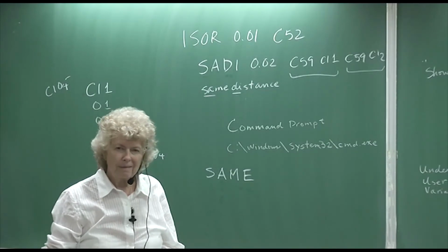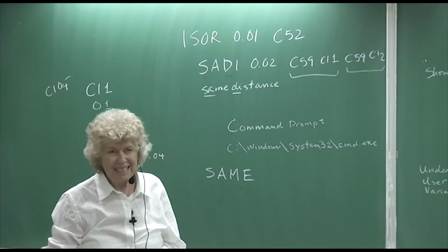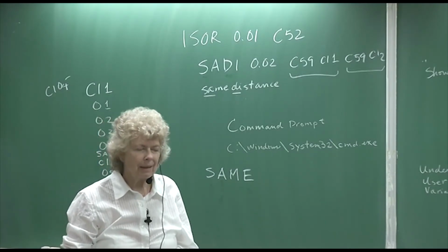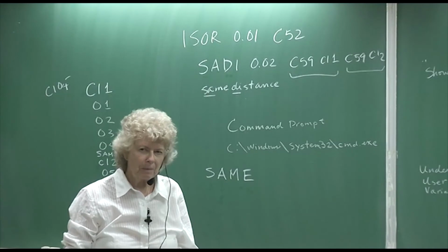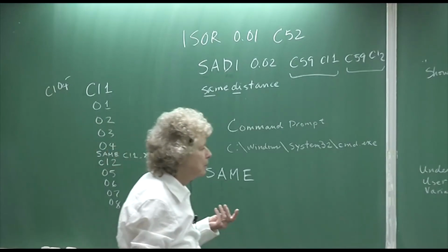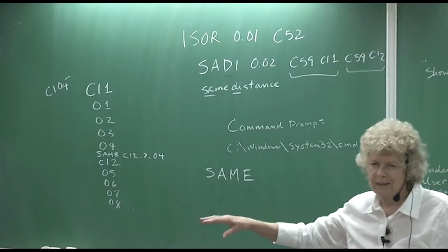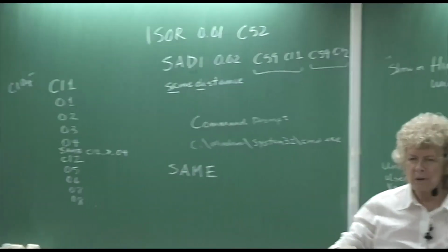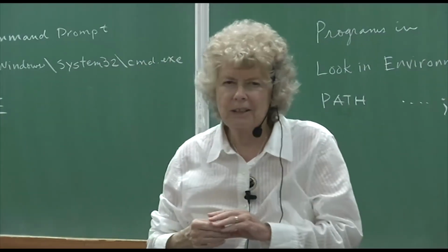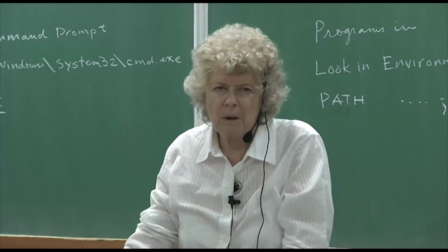There's several other new terms that have been introduced over the years, like SIMU and DELU, and I do encourage that you read the manual to read about those. I like SIMU better than DELU, but sometimes either one works the same. One of the things that it's doing is taking advantage of the fact that if you have a long chain, the atoms at the end of the chain tend to be vibrating more than at the beginning of the chain. And so you can allow it to more gradually change the thermal motion as you reach the end of the chain. And the program is very smart taking care of that.